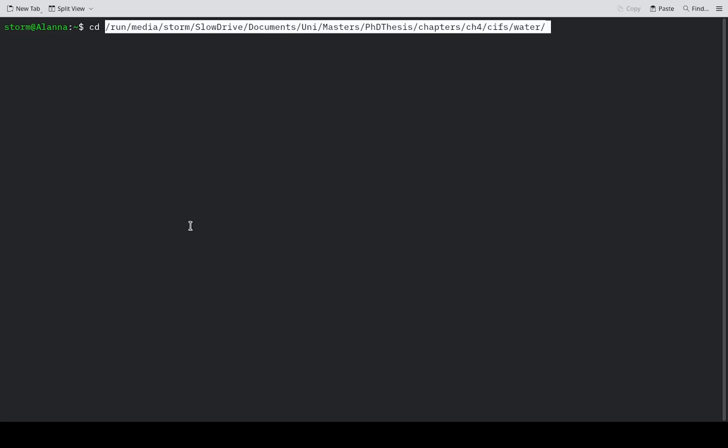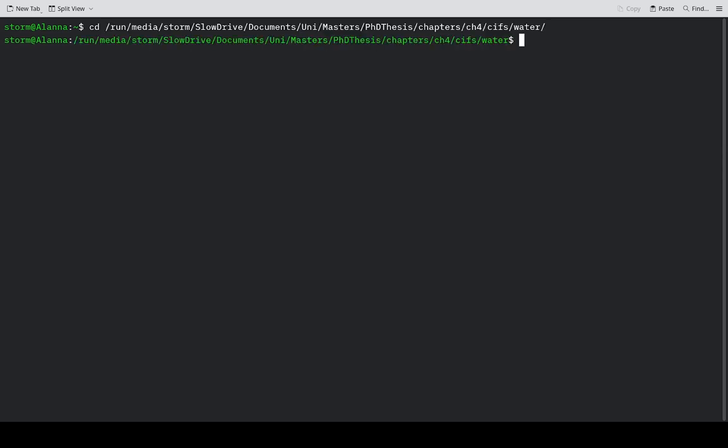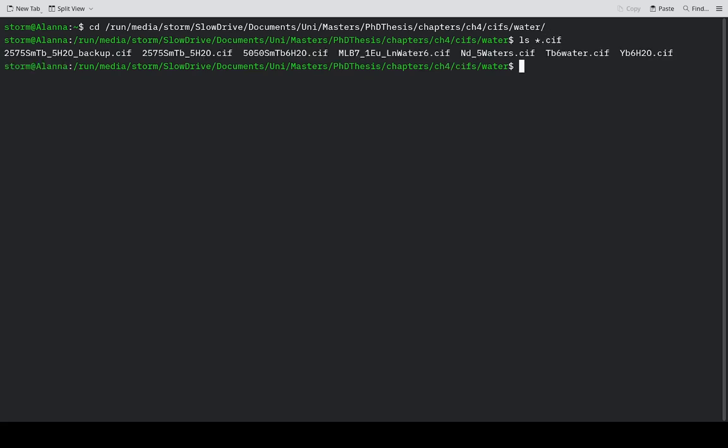First, go to the directory where you have the files stored. I've just picked a random directory with a bunch of CIF files in it. So I'll show you here.